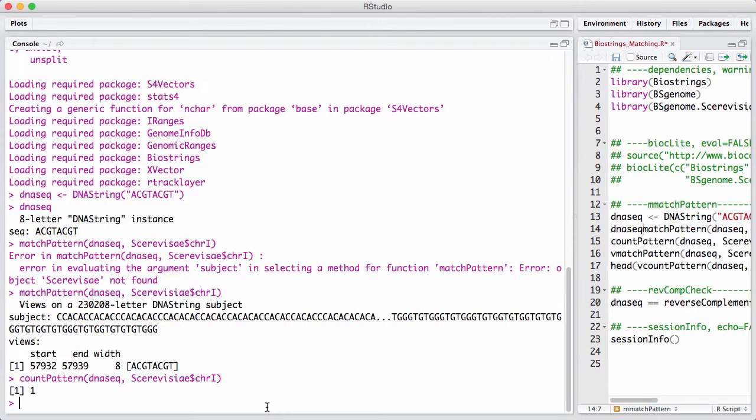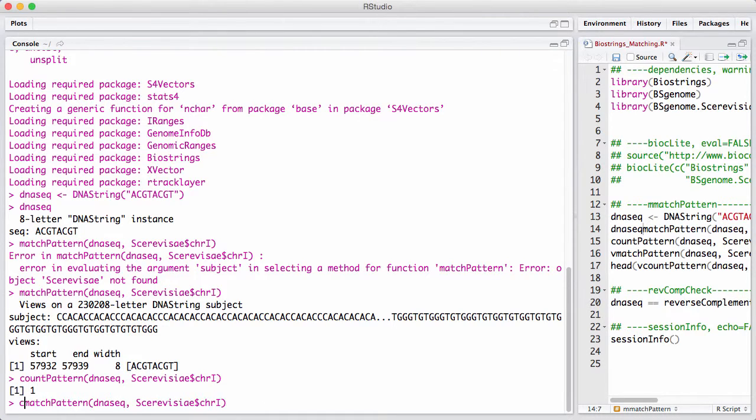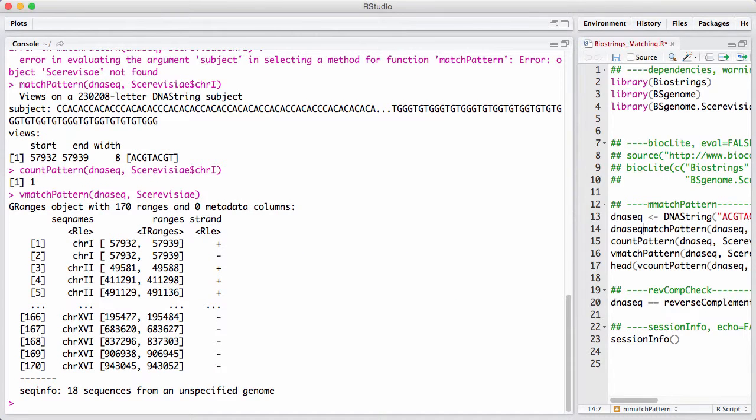For that, we have vMatchPattern. vMatchPattern matches one sequence against a set of sequences. The return object is a GRanges, and there's a couple of interesting things here.